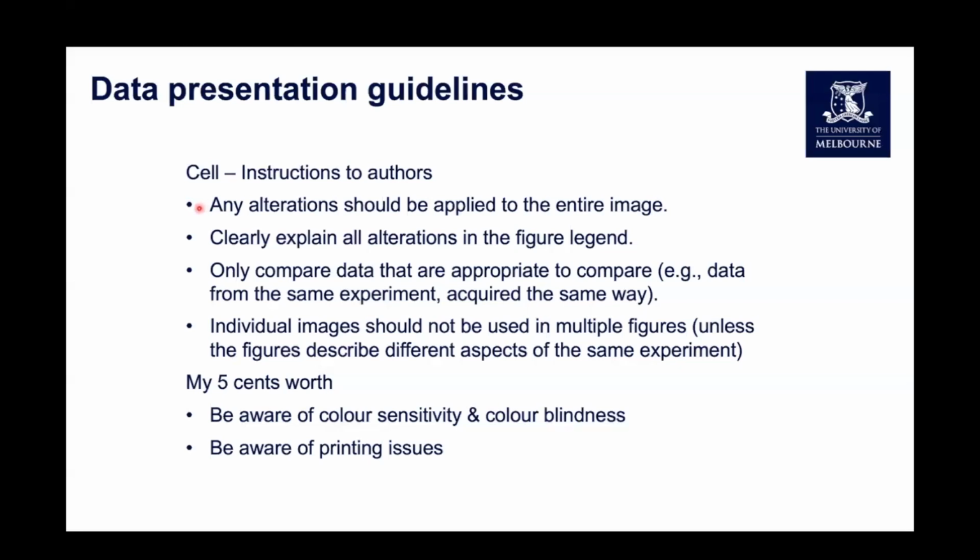Any alteration should be applied to the entire image and not specific parts within an image. Any alteration should be explained within the figure legend. If you are trying to compare data, then it should be acquired the same way within the same experiment. And this is journal specific, but individual images should not be used in multiple figures unless the figure describes a different aspect of the same experiment.